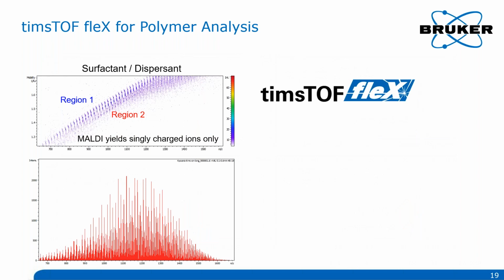Here's another similar example. The difference in this case is that this sample was analyzed using the timsTOF fleX MALDI source instead of the ESI. One of the MALDI advantages is that it yields only ions with a single charge, producing fewer branches in the heat maps. Not to mention that without LC, it also generates results much faster and can be used for insoluble polymers as well. Again, we can see the complete mass spectrum on the bottom left, which looks pretty complex.